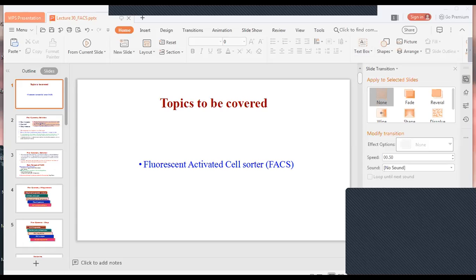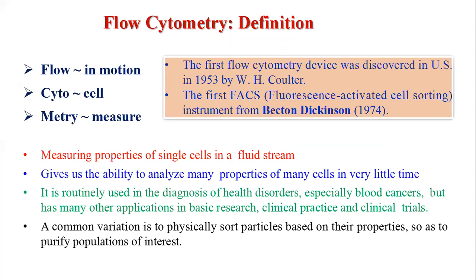So what is FACS actually? Before going to discuss about FACS, I'd like to discuss flow cytometry, because flow cytometry and FACS are very much similar. They have very similar applications. The two types of instruments are more or less similar, but some additional attachment is there in FACS rather than in flow cytometry. But the principle is almost similar.